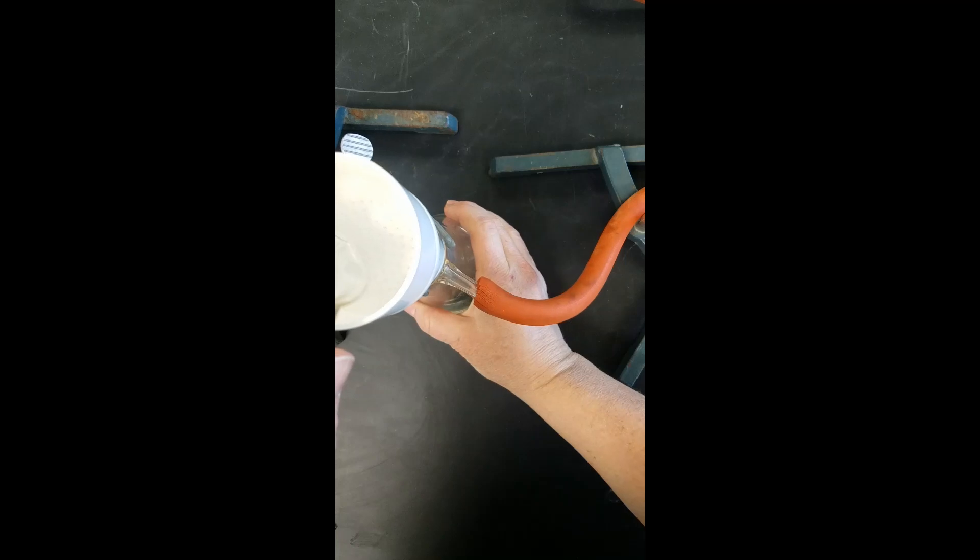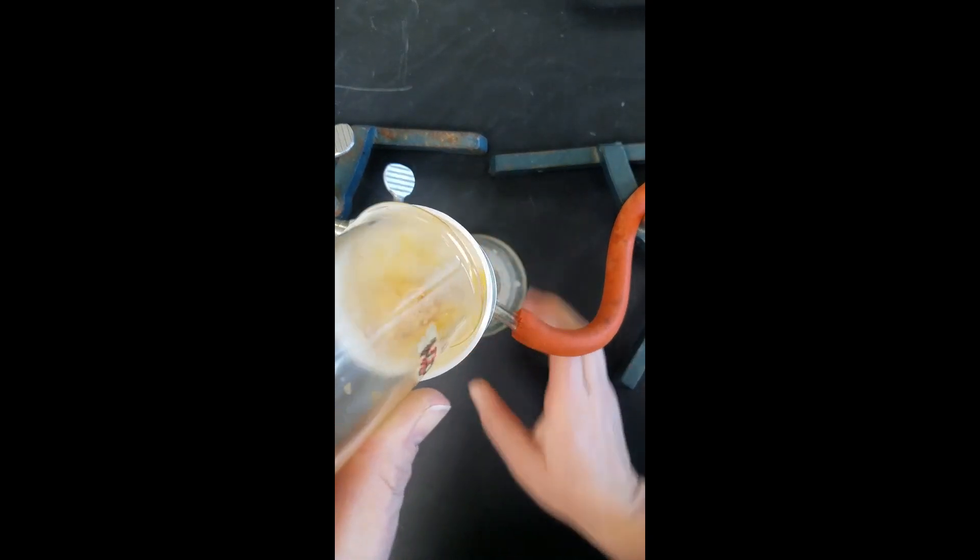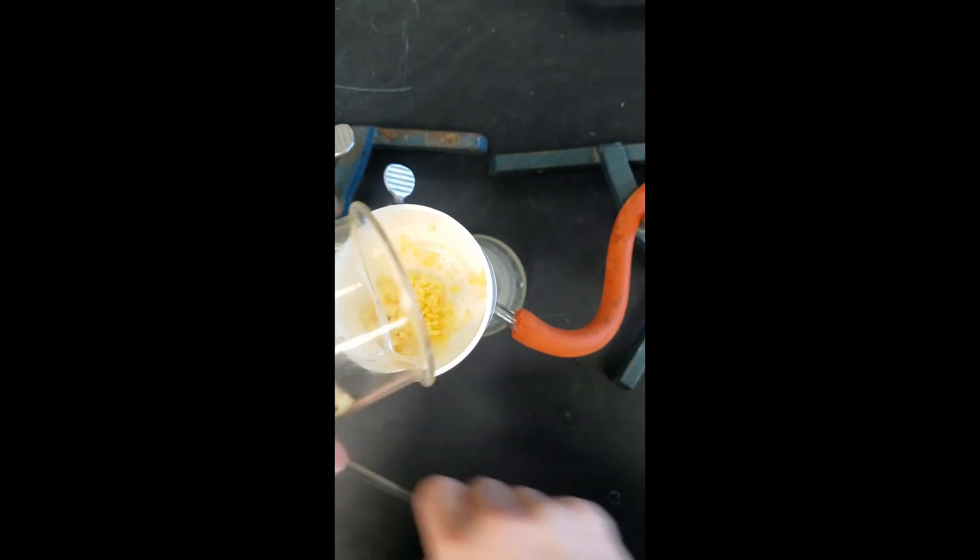After this has been stirred for one minute we're going to turn the vacuum on. We're going to pour our chips into our funnel here. I'm trying to get all of the chips in there. We're going to let that run for about one minute to pull as much of the petroleum ether out of the chips as possible.